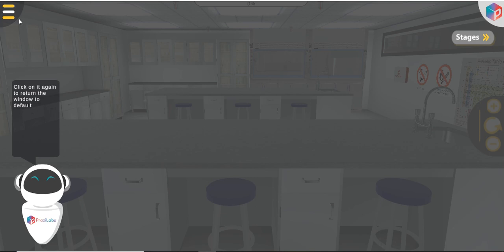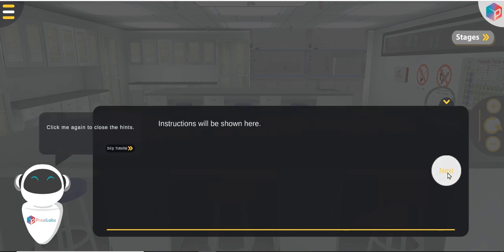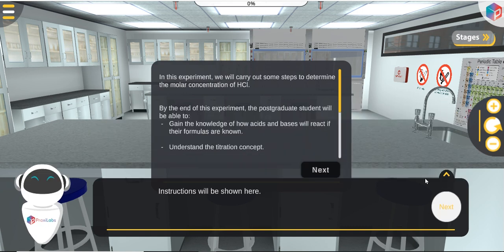Okay, so I will let you in to see how this works. Let's see. Okay, yeah, we got it. So the experiment title is determination of molar concentration of hydrochloric acid, HCl.